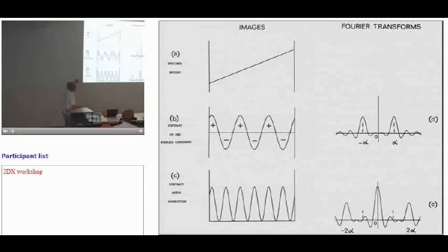And provided your crystal is relatively thin and your voltage is high enough, these are more or less the same Fourier components. So in our original programs, the way we corrected for them, this is TT box, TT refine, and TT mask. You multiply the original image by the tilt transfer function in that region of reciprocal space, and essentially correct the contrast by multiplying in the computer by the same function that happened in the microscope. And this is what you end up with. So everything is corrected, but where you had a 0, and therefore you only had noise, you're also multiplying by 0.